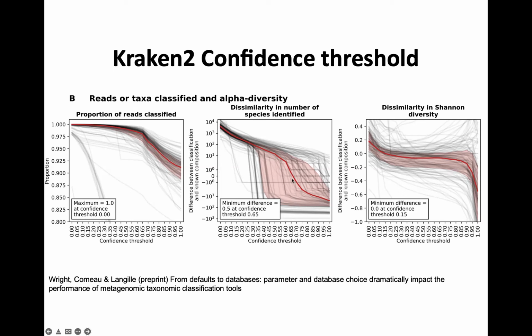I'm not going to show you the rest of it. Unfortunately, this is just using one database, and depending on what database you use, finding the maximal cutoff, of course, changes. But something in the middle looks kind of good.